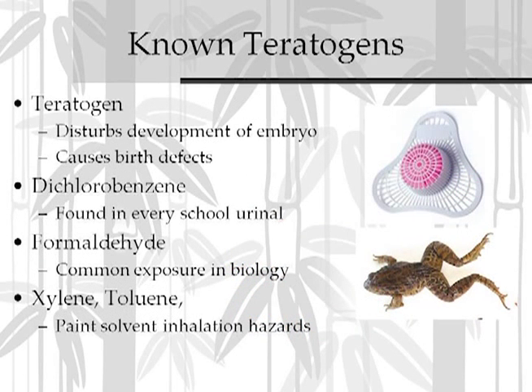Teratogens are a group of compounds that people are not as familiar with. It's a term that people have not heard as often. These are essentially developmental toxins. These are things that interfere with the development of the embryo, and they can carry on through multiple generations. One of the teratogens we find commonly in schools is paradichlorobenzene, and the most common place we find this is in the urinal in every boy's bathroom in schools. Occasionally we'll find the blocks hanging on walls in the girls' bathroom also.